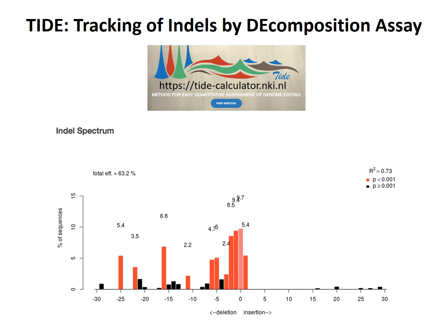The ones that are currently available to use with protein are pretty cheap. You can get them for maybe $150 if you get the two-component RNA. So if you order the tracrRNA and the crRNA for your gene and use that with Cas9 protein, you can get them for around $150. Those are called RNPs, ribonucleoprotein complexes with Cas9.